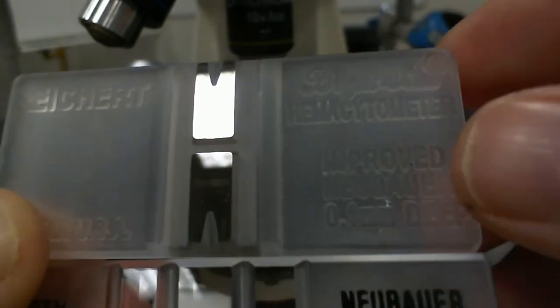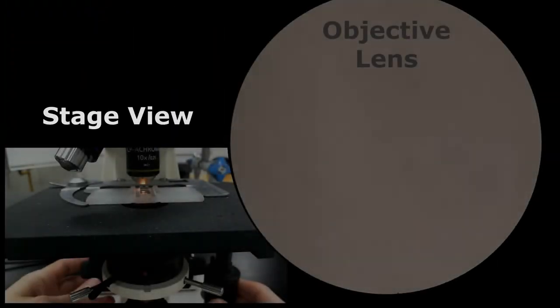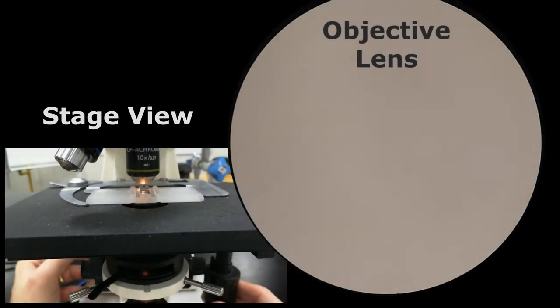Okay, so I'll start with this one first so that you can see the grid. Okay, so here we are, our chambers under the microscope. We just need to get into focus. This can be a little tricky to focus initially, so I suggest that you do this without the cover slip on there first. So before you even have the cover slip, before you apply your sample, clean your chamber, put it under the microscope, get it into focus first.